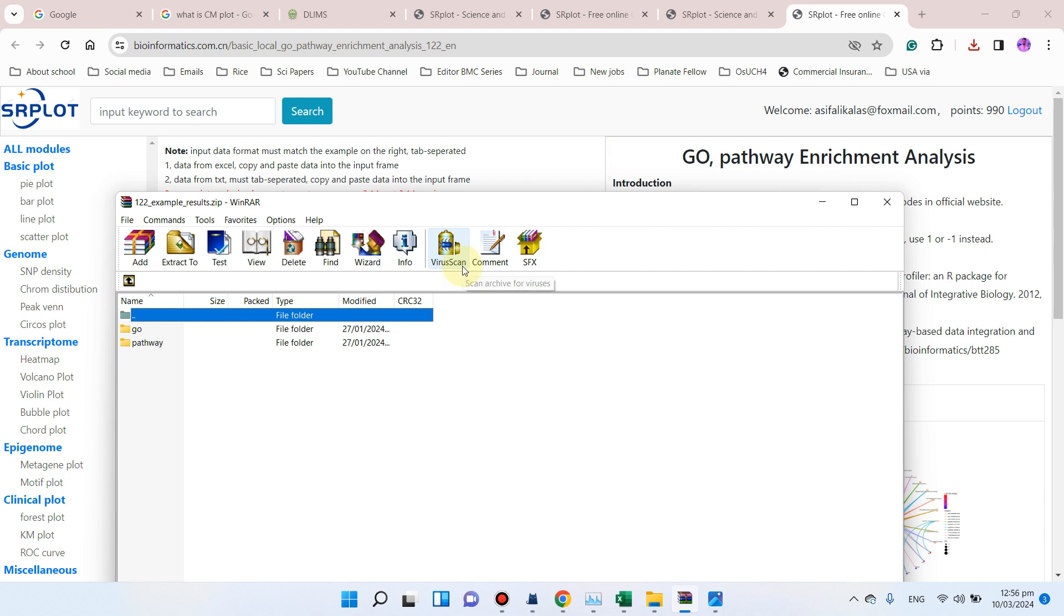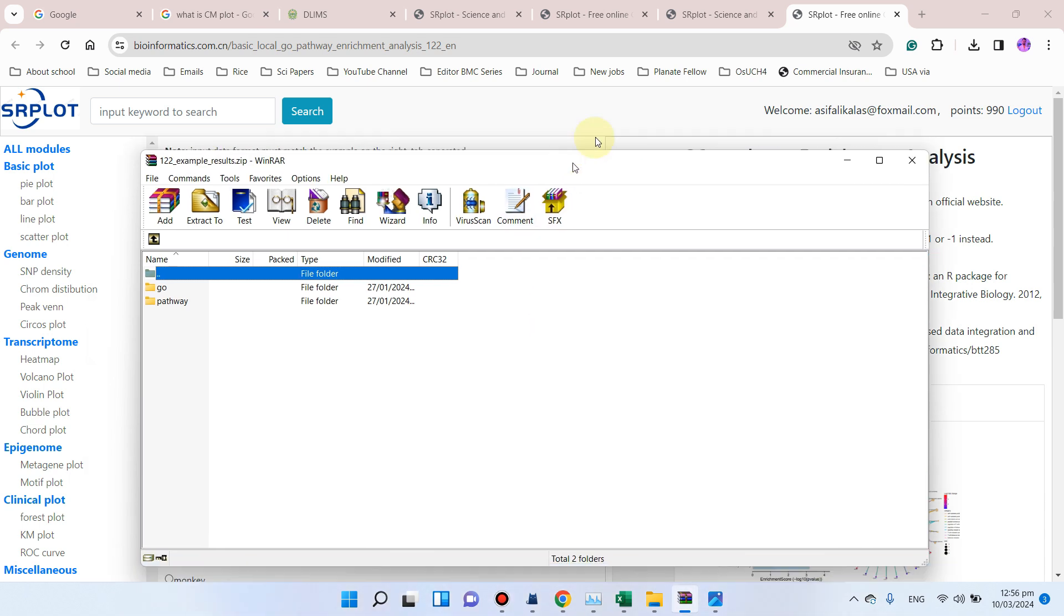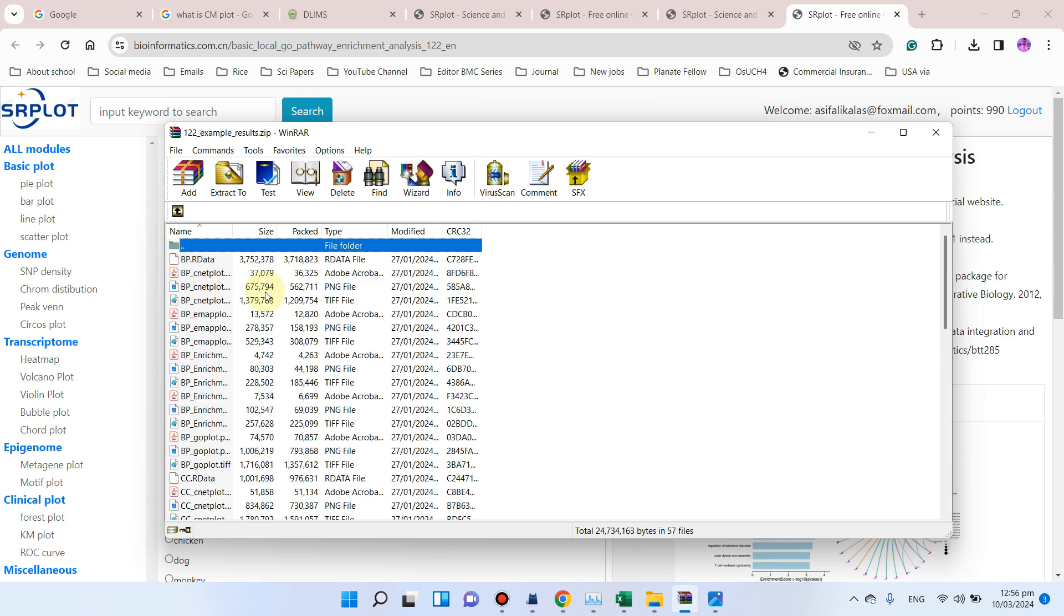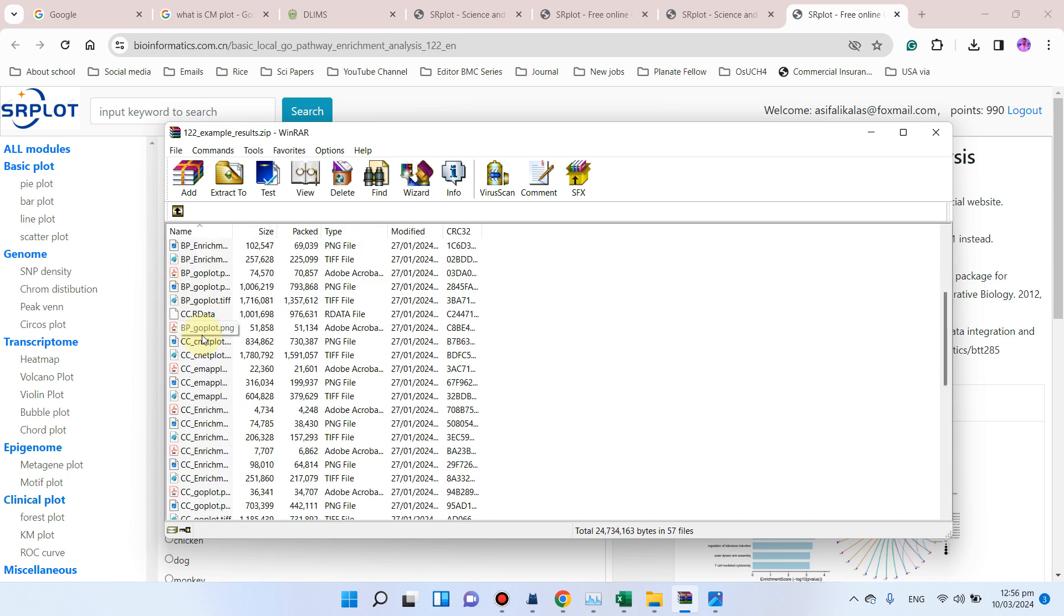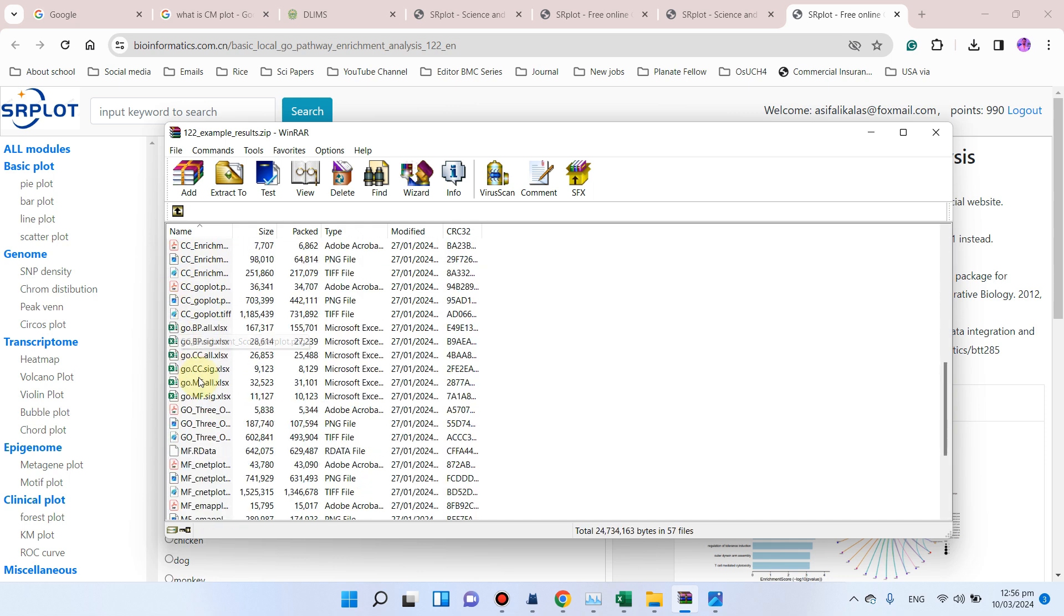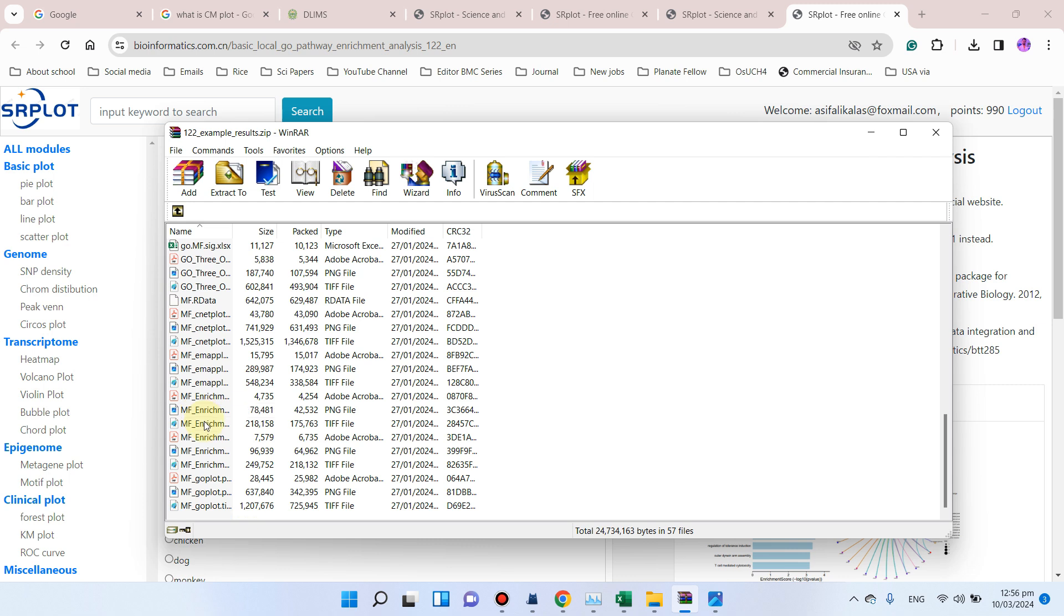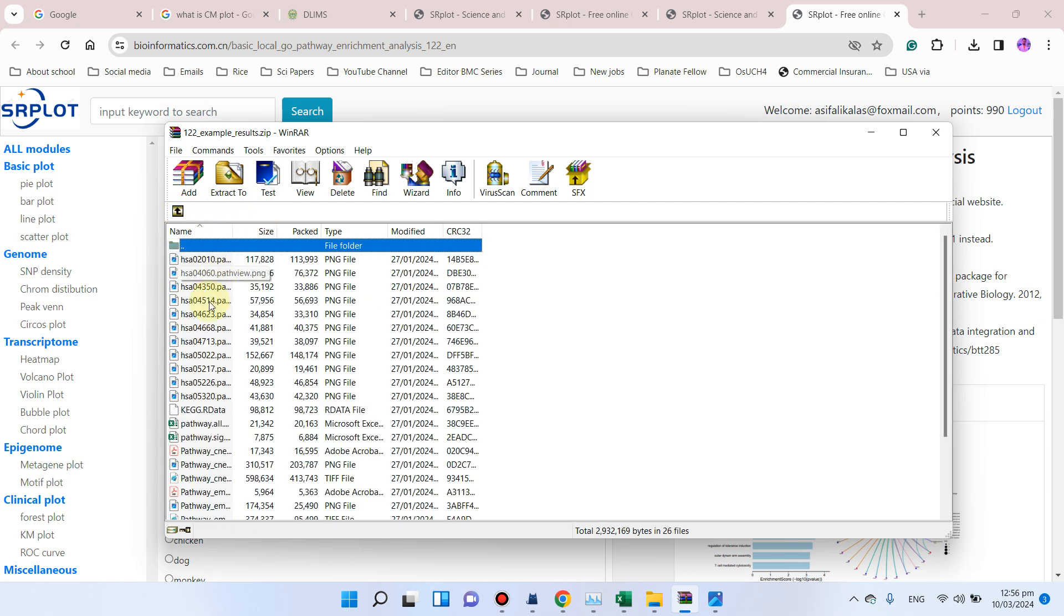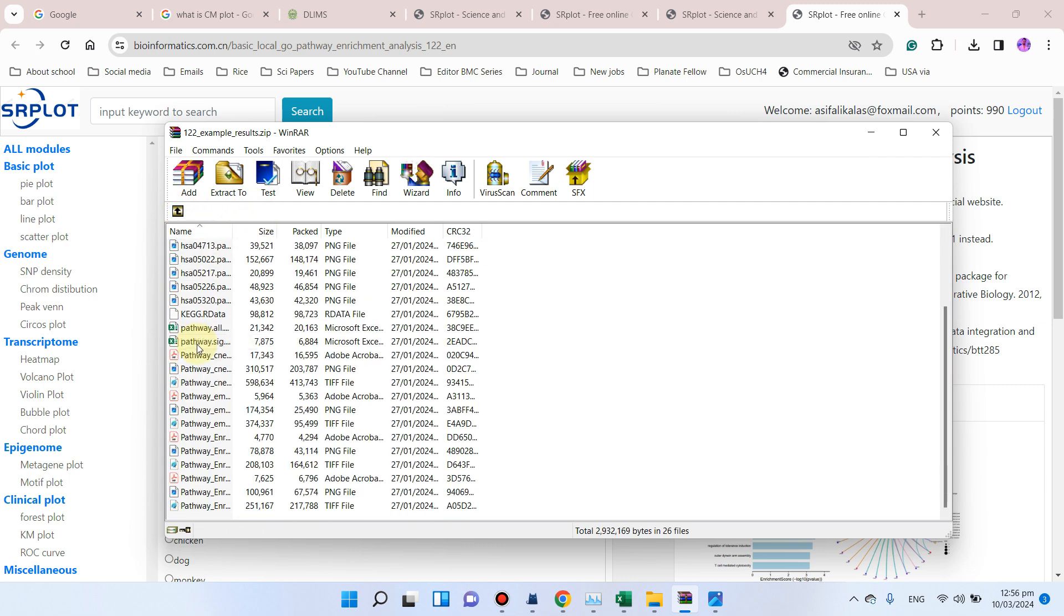Welcome to another video tutorial. In this video, I will show you how we can draw complete GO enrichment analysis including different Excel files and pathways like this. Here you can see we have two folders, one is GO, and you can see it has all the folders and all the Excel files.